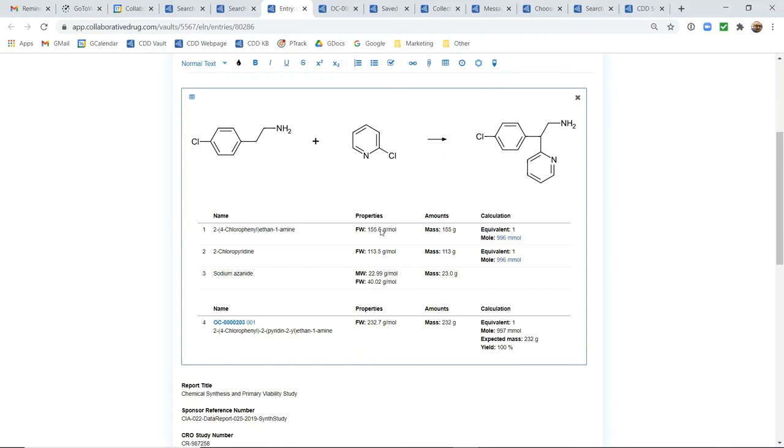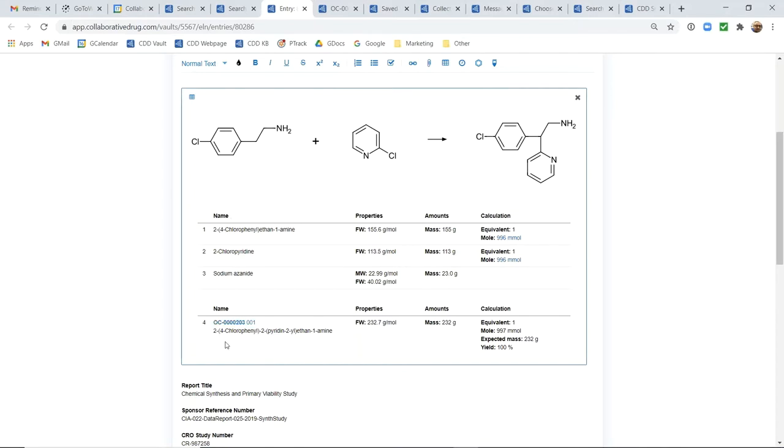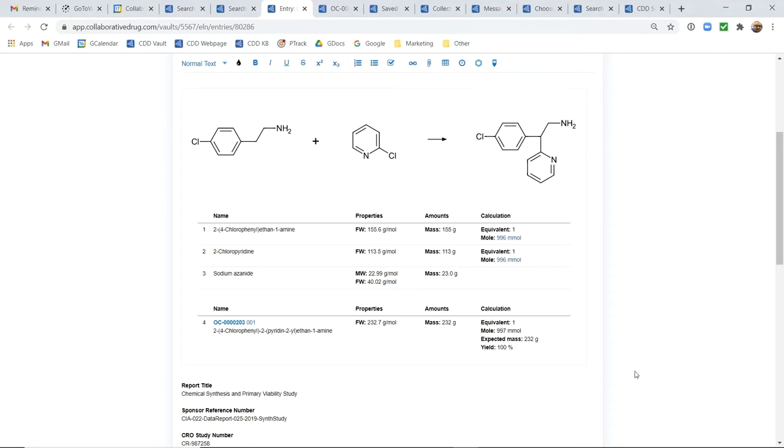For any of the reaction components that may already be registered in your vault, we will automatically show you the molecule ID and also any that are not or that you wish to register again, maybe another batch, we give you the opportunity to register any of these reaction components into your registration system.